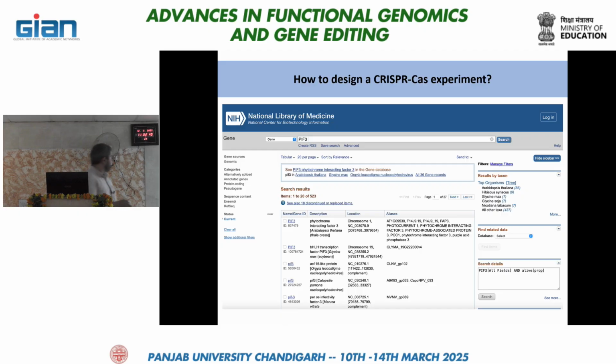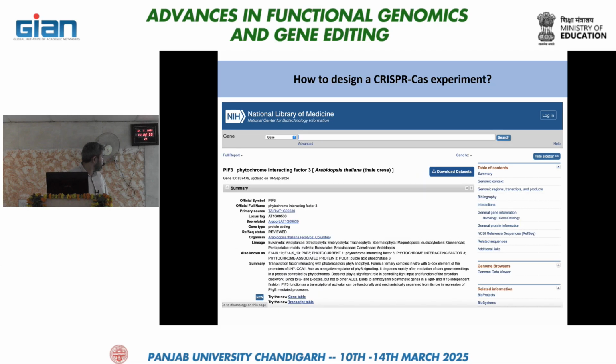So you can type the name of any gene. The first gene ID you get, you can just click it after selecting the gene here. Otherwise, it will open a lot of things which we don't want. Once you click it, you will reach this page where all the description about this gene will be there, and you can scroll down.